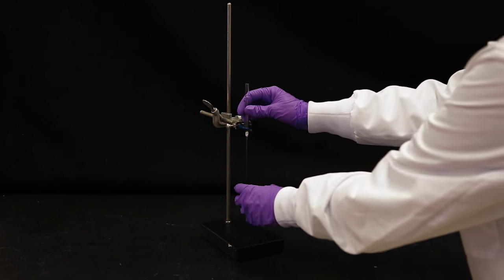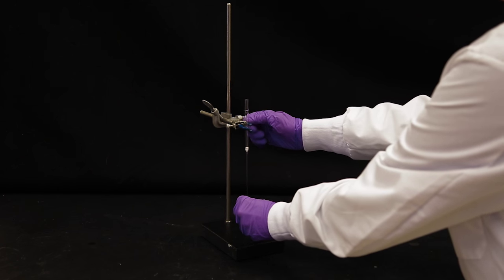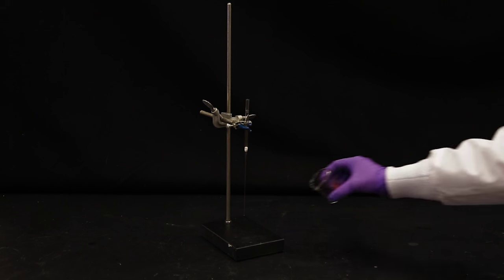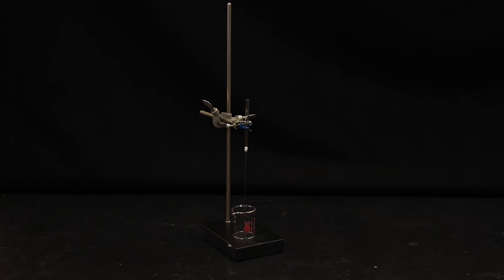Using the clamp, attach the filtration pipette to the ring stand. Place a beaker directly beneath the filtration pipette.